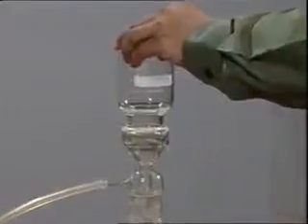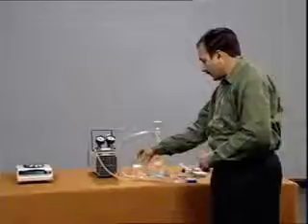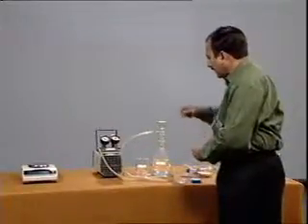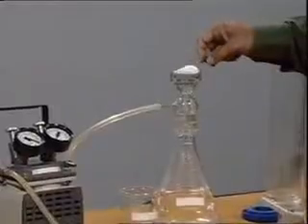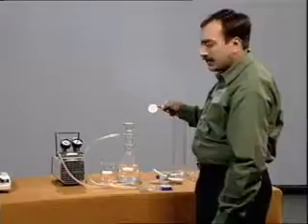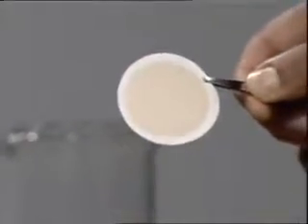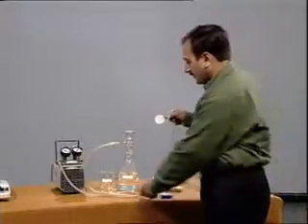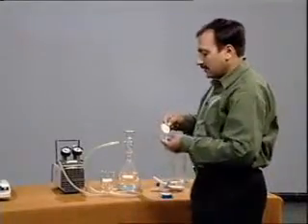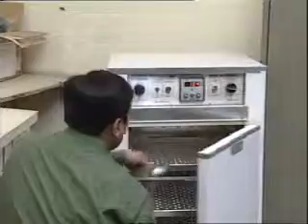Now, take out the funnel and lift the filter paper using the forceps. Now, we can see that the suspended impurities have been retained on the filter. Now, first we will dry the filter in the oven at 104 degrees centigrade for 1 hour.